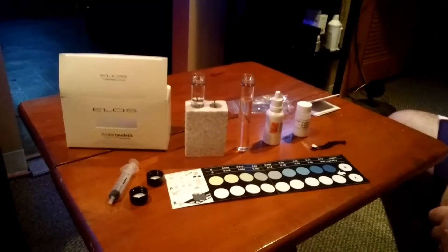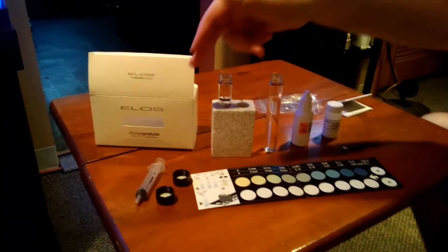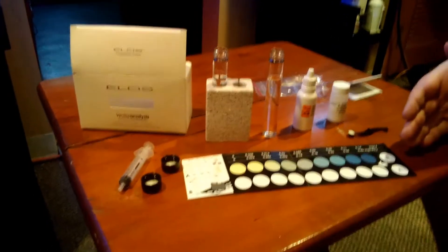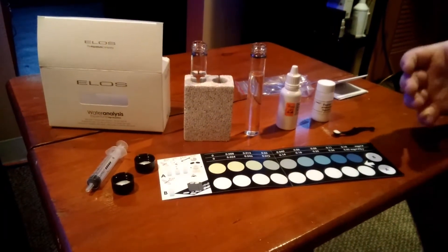What's going on everybody, this is 40bNasty. I'm here to show you the ELOS Pro phosphate test kit. I'm going to show you everything that is included in the box and how to use it.